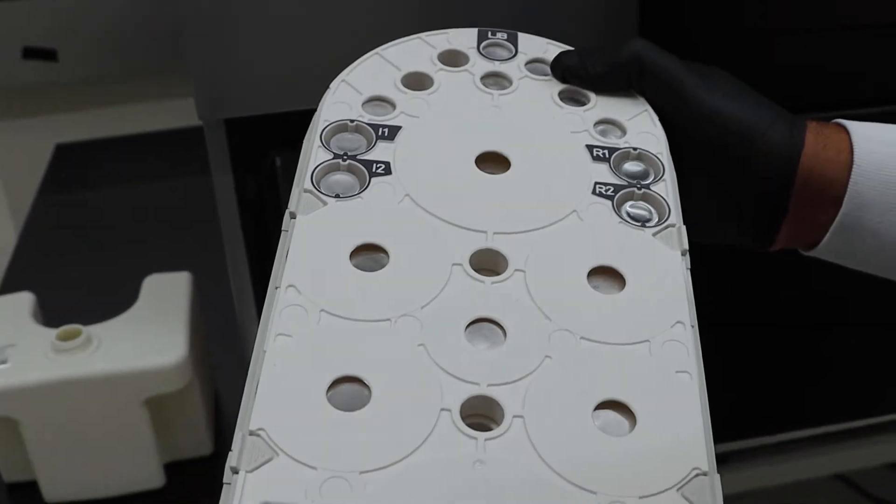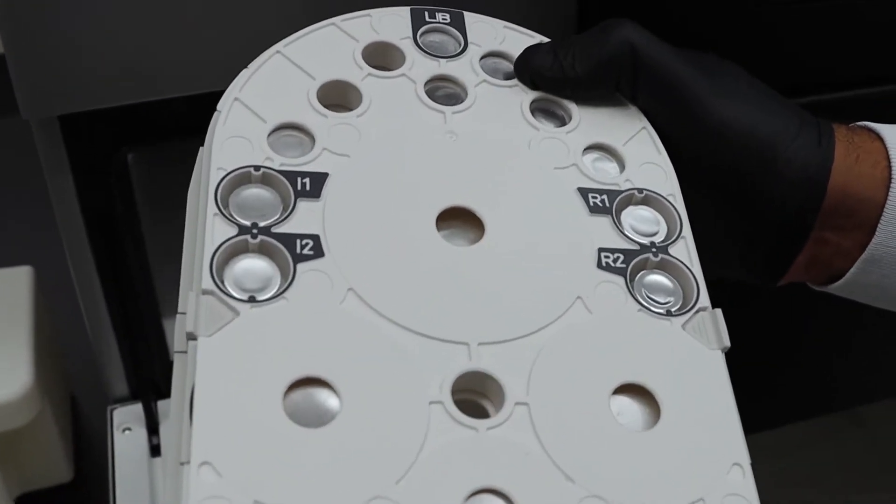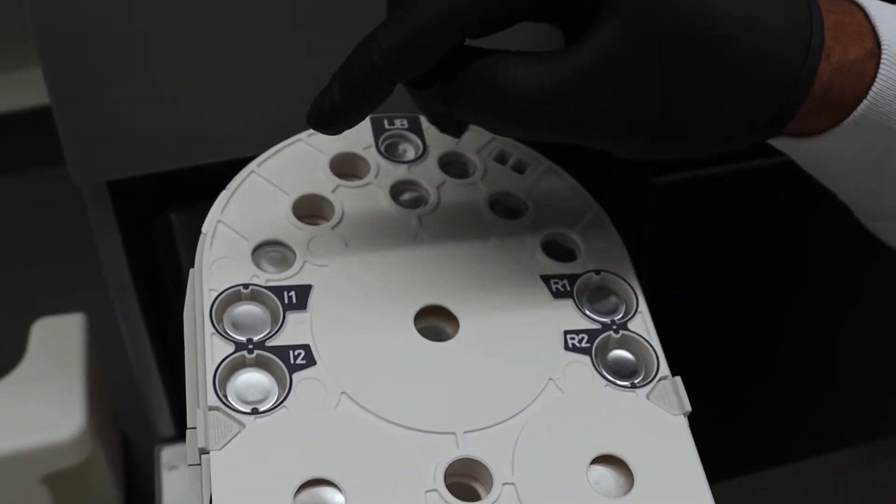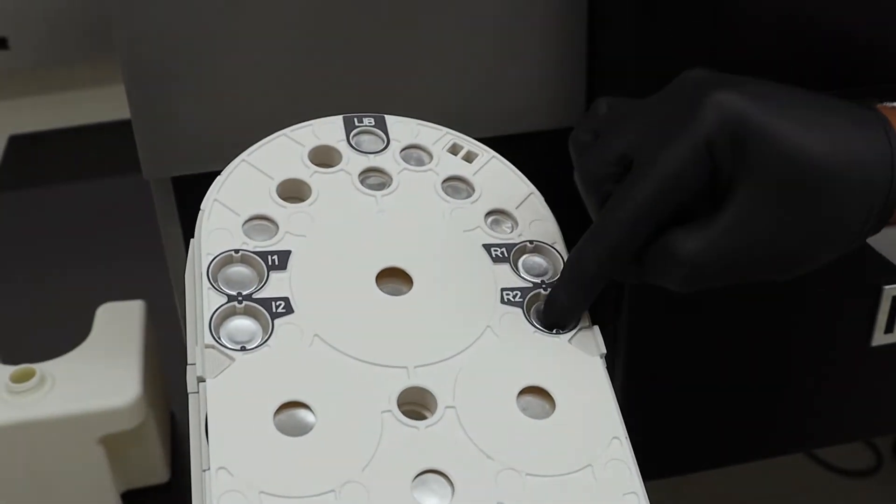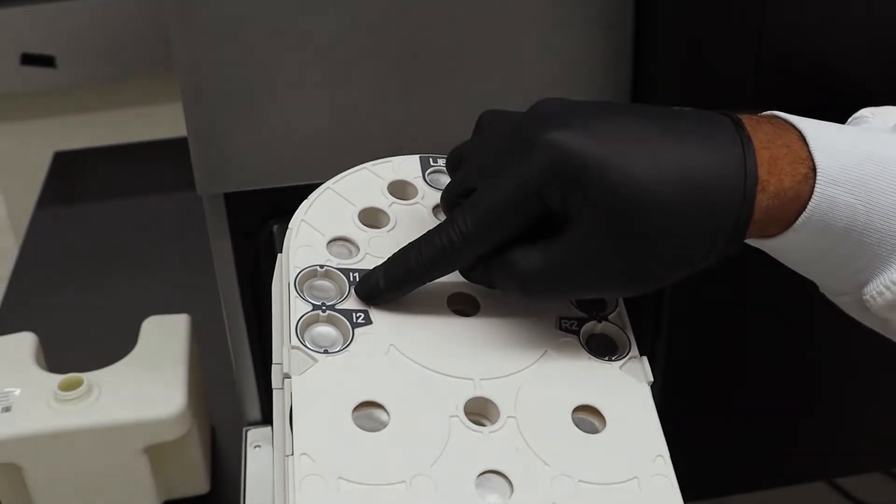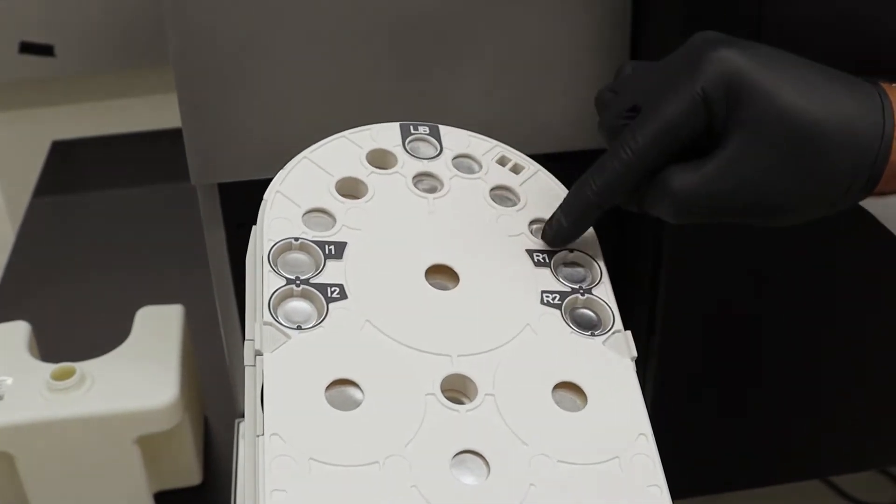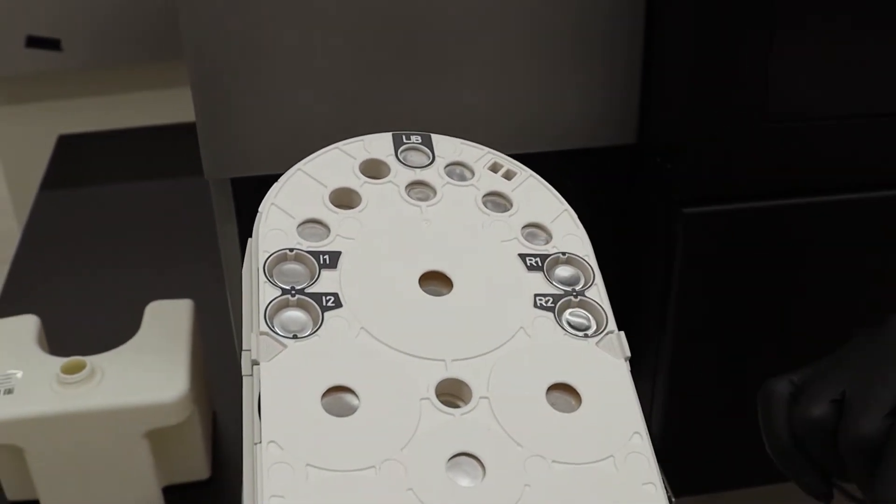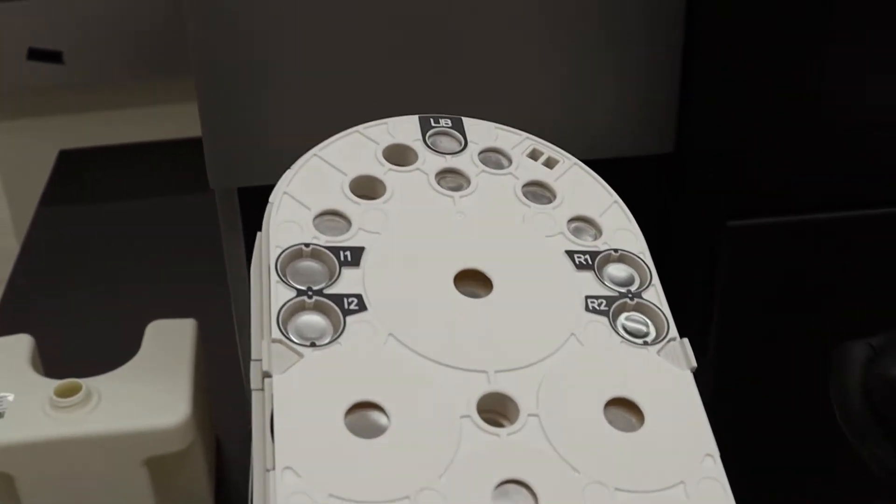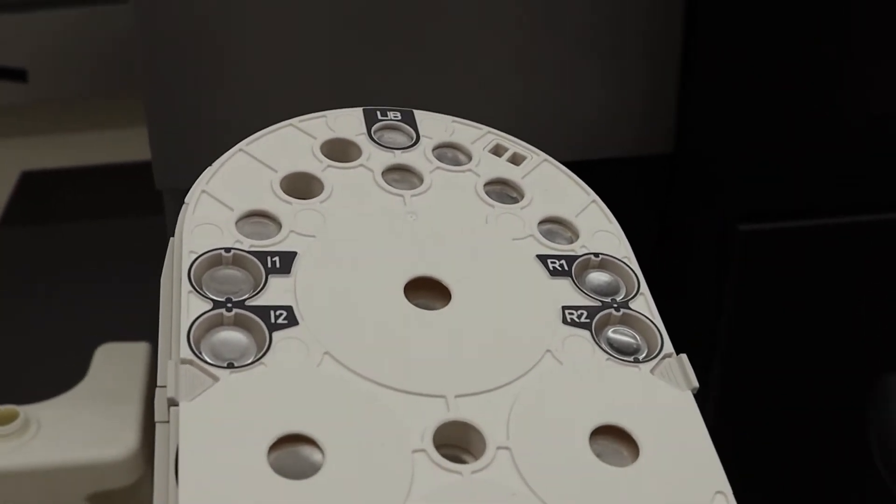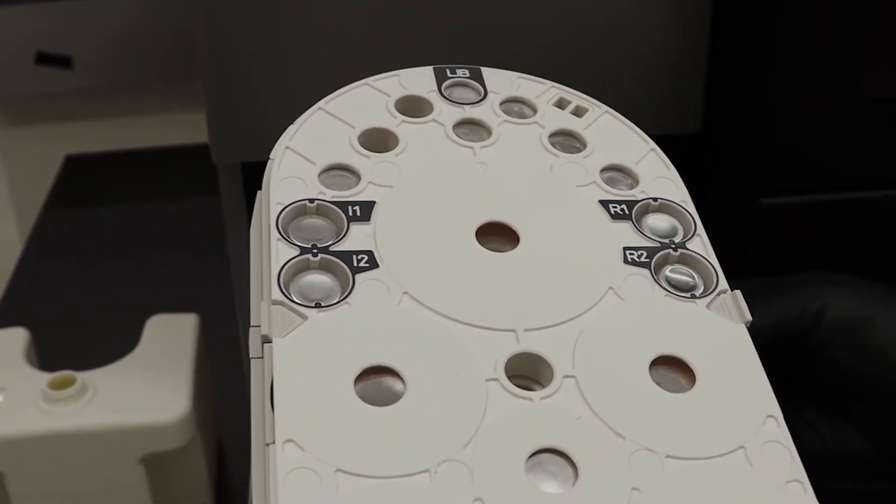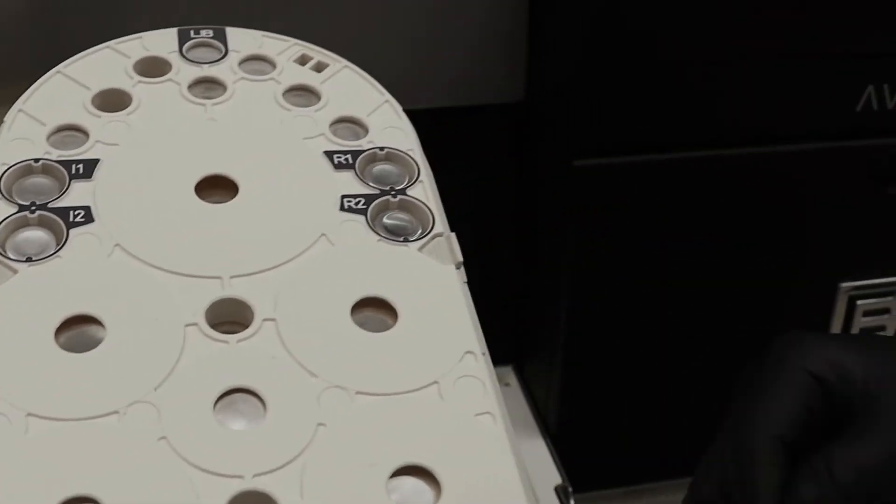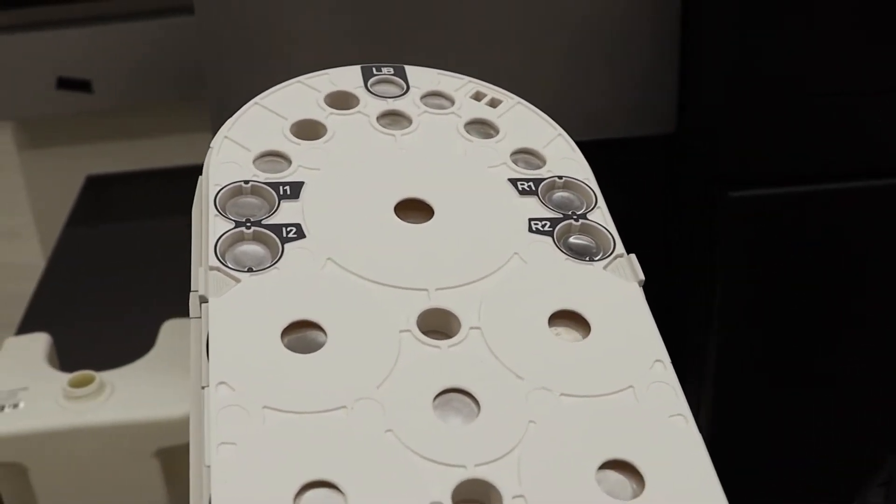You'll notice that at the top of the sequencing reagent cartridge, there are five locations: Library, I1, I2, R1, and R2. This stands for index one, index two, read one, and read two. Each cartridge is preloaded with the primers for the Elevate workflow. If you want to use the Adept workflow, you simply swap the tubes here with a set of four we provide with every sequencing cartridge. You never have to buy these separately. It's an easy access poke-through design.